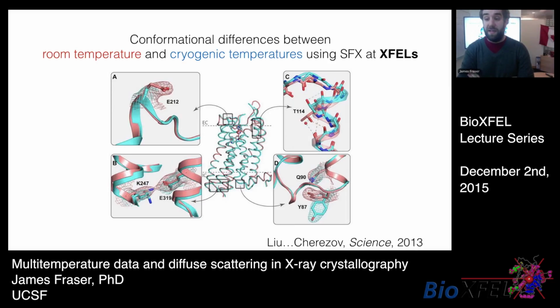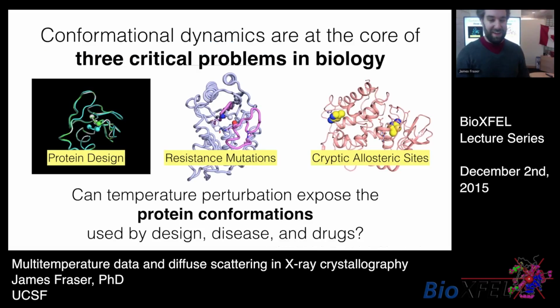As was pointed out, there are multiple factors at play here. I'm inclined to think that the major difference is simply the effective temperature that the protein is feeling, and certainly the vacuum maybe making it somewhat different than at room temperature. But there are definitely multiple factors at play. Does that make sense? Yeah, thanks. I'm going to continue. Thank you for the back and forth, though.